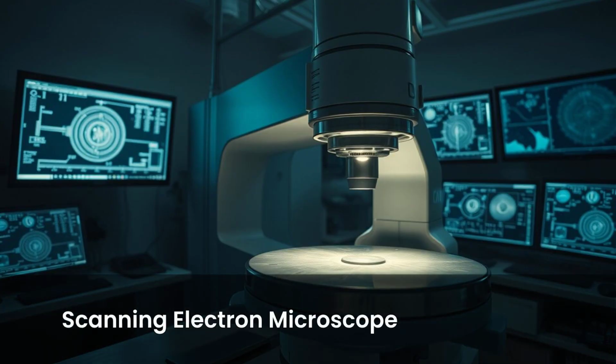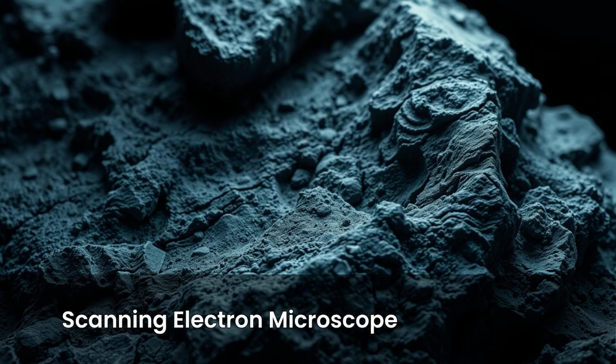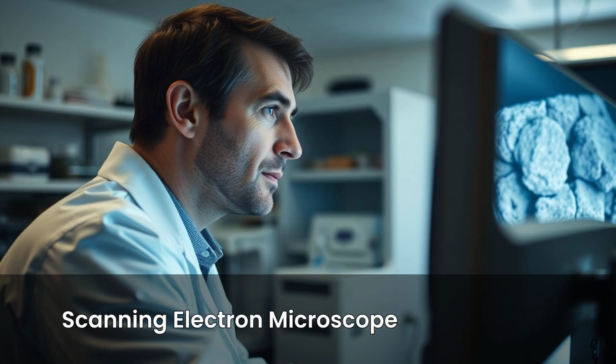3. Scanning electron microscope, SEM. For ultra-detailed imaging, we use a scanning electron microscope. The SEM gives us a high-resolution view of the surface of rocks and minerals, revealing textures you wouldn't believe. It's like zooming into a whole new world.